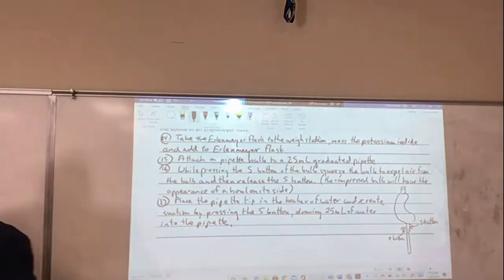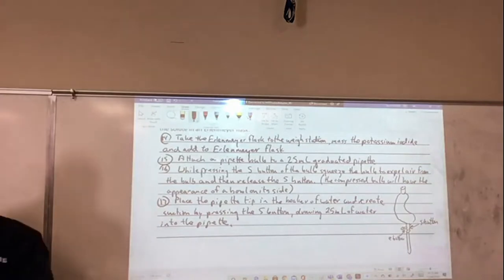So do I want to draw 25 milliliters into it, or do I want to actually draw a little more into it? Yeah, because of the little air. Yeah, drawing, so I should say a little more than 25 milliliters there, so a little more than.